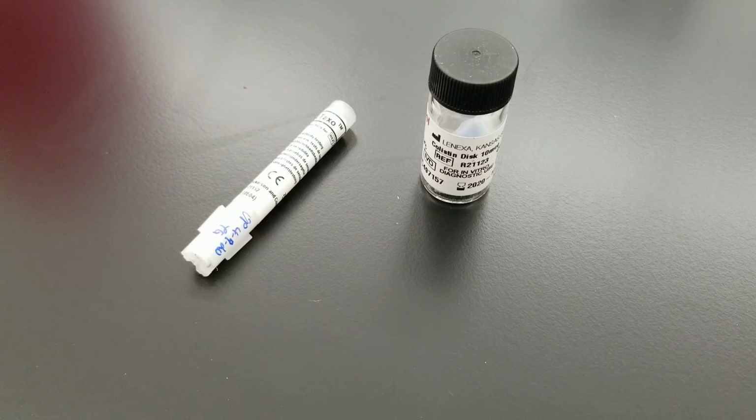Hello everyone, today we're going to be talking about anaerobes and specifically the aerotolerance test. So when we describe anaerobes, we describe them in a few different categories, but I'm going to touch on three. There are the obligate anaerobes that cannot grow in the presence of oxygen and will surely die during exposure to oxygen, and that's due to the fact that they don't have enzymes that would protect themselves from oxygen or be able to use oxygen in their normal metabolic processes.